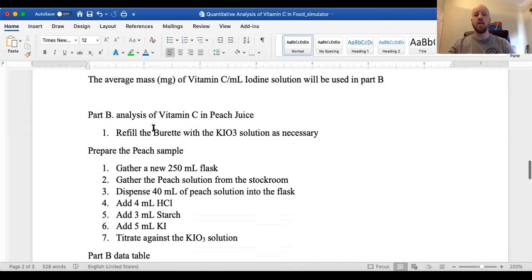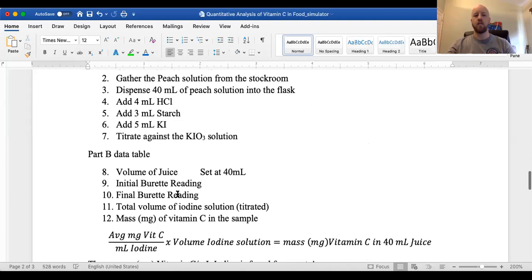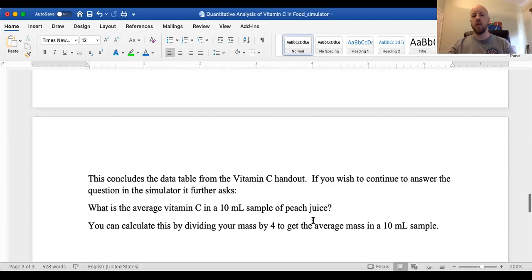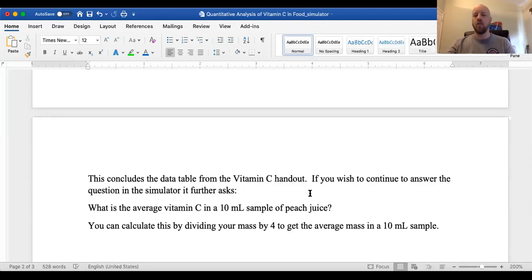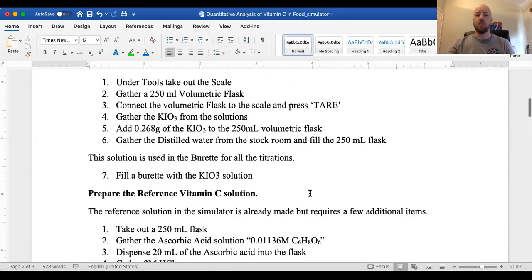And then in part B, we're using the same potassium ioate solution. And then our peach solution from the simulator has again the same components: HCl, starch, potassium iodide. So we'll do three titrations. And at the end, you should be able to calculate the approximate mass of vitamin C in 40 milliliters of the peach juice. And then you can ultimately answer the simulator's questions where they're really looking at 10 milliliters of peach juice. And then you can essentially compare this to what is the actual amount of vitamin C usually found in peaches.